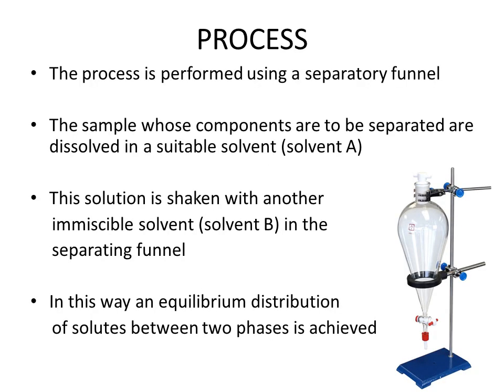Now we will see the process of solvent extraction. The process is performed using a separatory funnel. This is the apparatus for solvent extraction, and this is called a separatory funnel, and it can be fixed on this stand. And here is the stopper over here, which can be opened and closed.